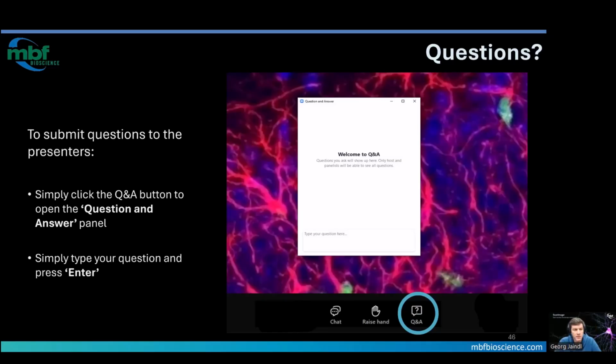That being said, the tiling or the mosaic functionality is completely scriptable as well. So if you have a specific algorithm in mind, you can always specify tiles yourself and arrange them in any way. So that's definitely a possibility. You can automatically generate that mosaic scan and have any type of order of the tiles and any type of configuration of the tiles you want to.